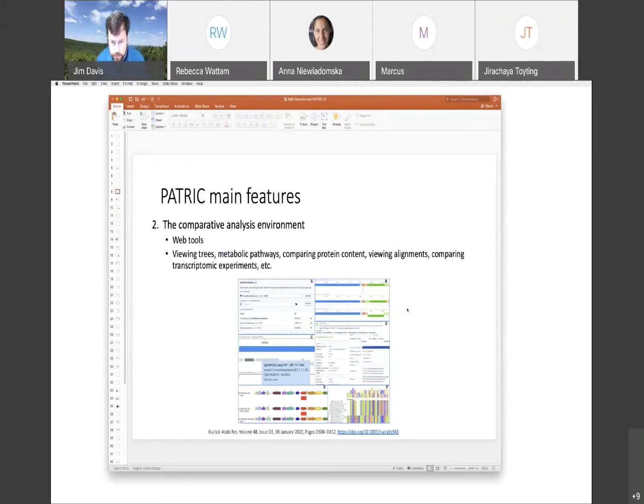Here it is. It's down here in the bottom left corner. You can compare genomes this way, and you can see the operon structure sometimes pops out because it decays with phylogenetic distance. But we don't have a specific algorithm for calling operons.